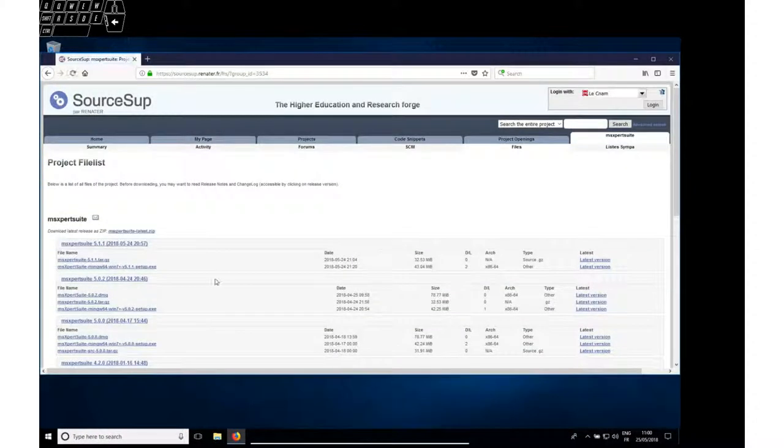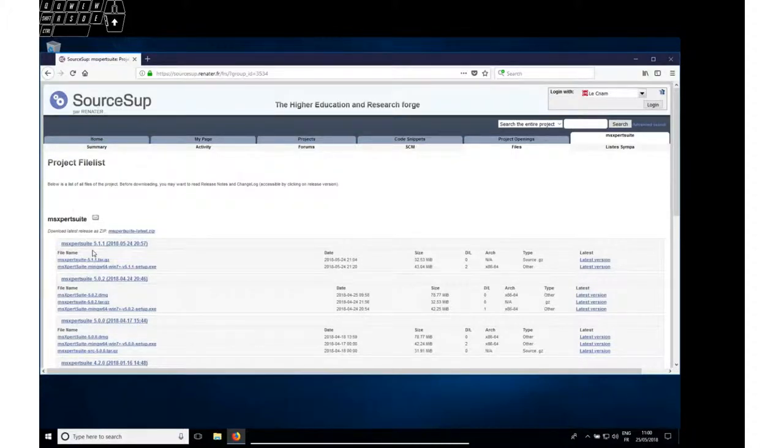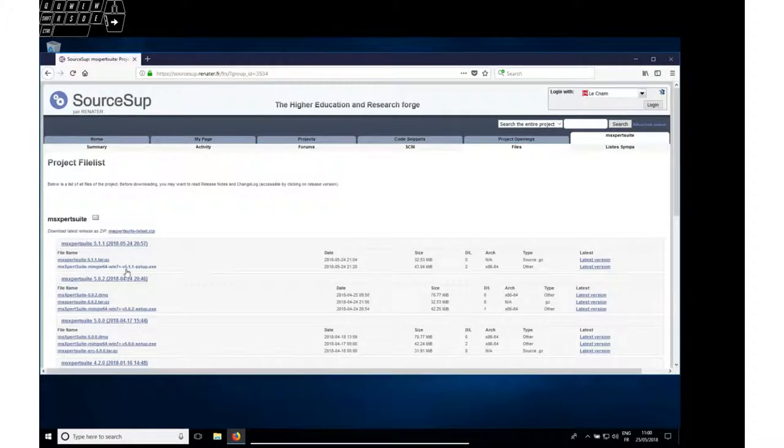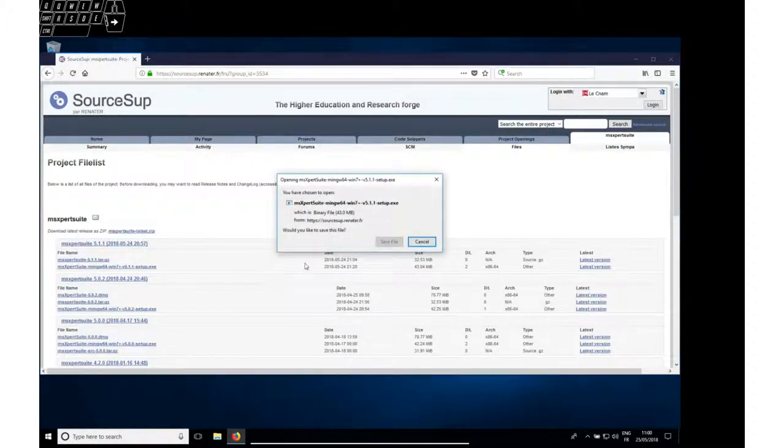The last release is always on top. It is at the moment version 5.1.1. Select the Windows setup installer and download it.